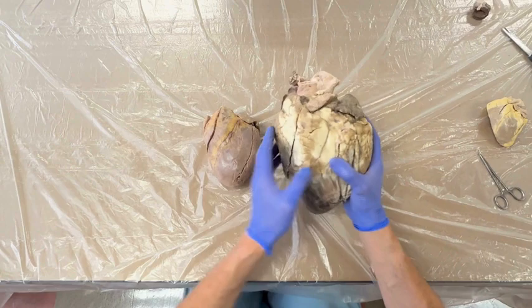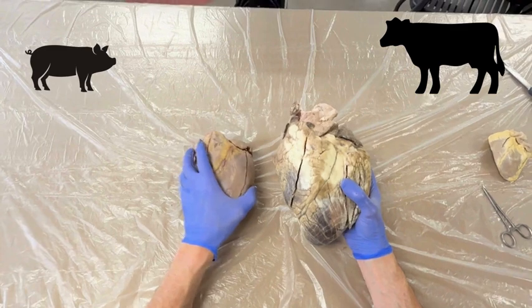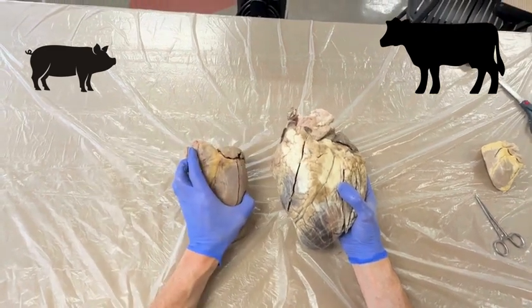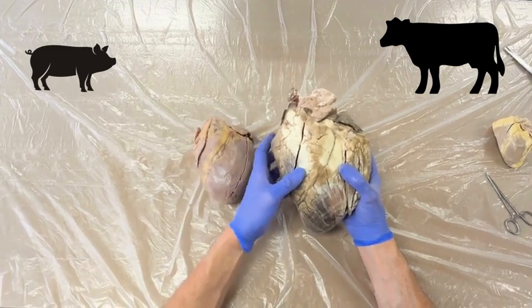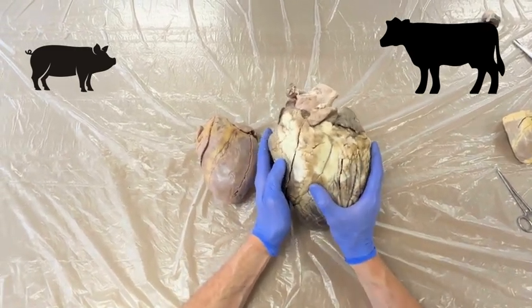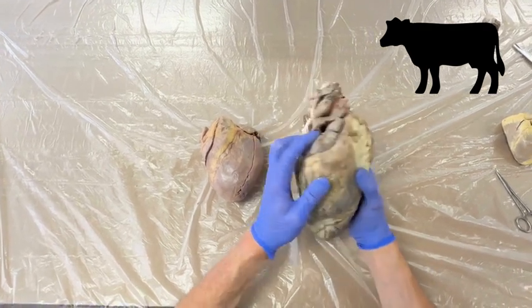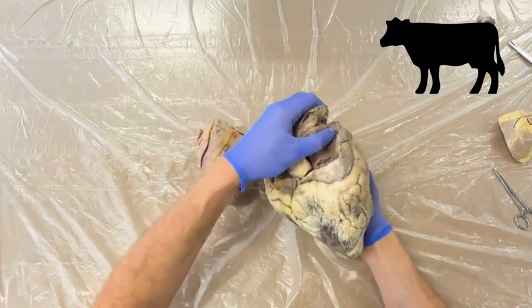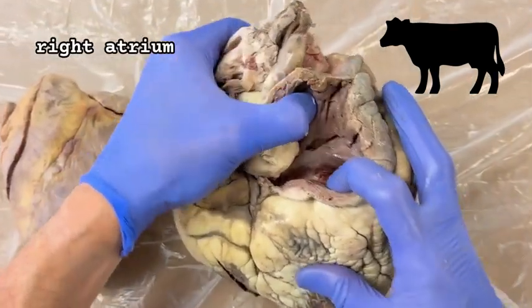So here we have a cow heart next to the pig heart, and you can see that the cow heart is just massive, and this is related to the size of the animal. Cows are so much bigger than pigs. We're going to walk through the structures though, which are very similar between pigs, sheep, and cows. The right side of the heart is shown here. This is the right atrium.